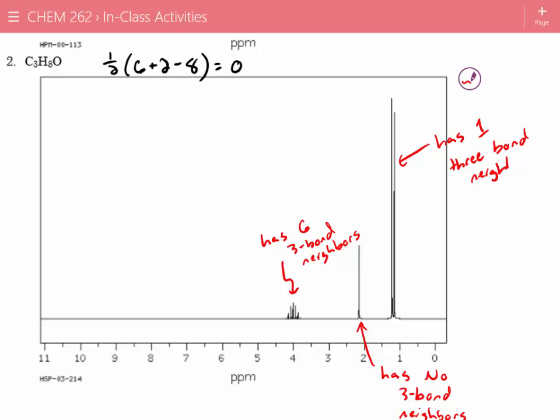Okay. So we've used our detective work. We can even analyze the chemical shift a little bit, but we know that this is in the range where it's not going to be an alkene, it's not going to be aromatic, it's not going to be an aldehyde, obviously, and it's not going to be a carboxylic acid. So it's probably going to be some combination of an alkane, right? So now what we can do, and oftentimes this is what chemists actually do, is they draw out the potential isomers. And then they try to look at those isomers and they say, which of these isomers fits the data?